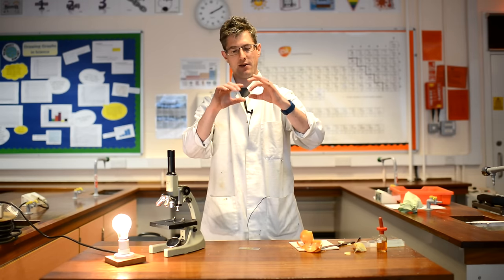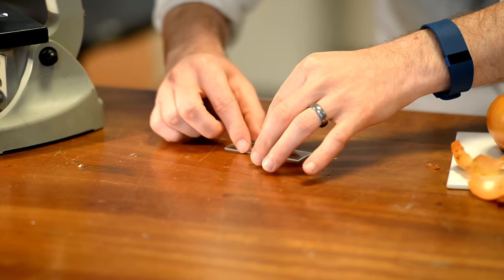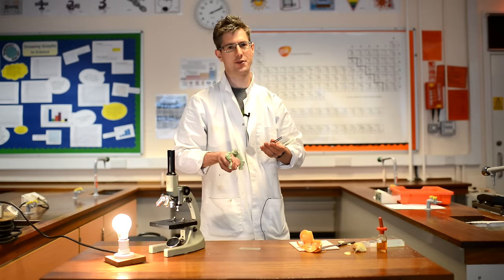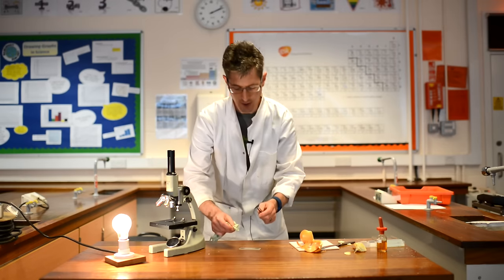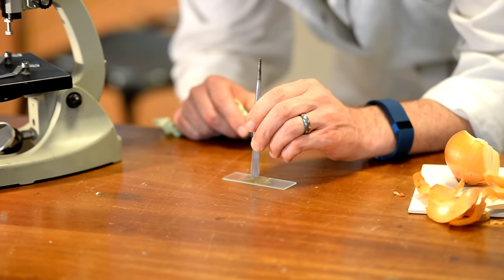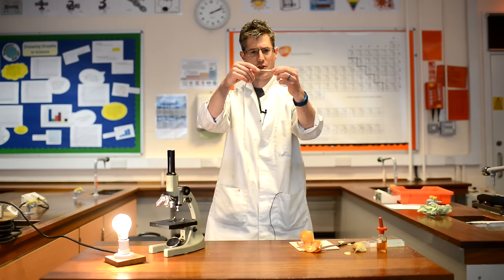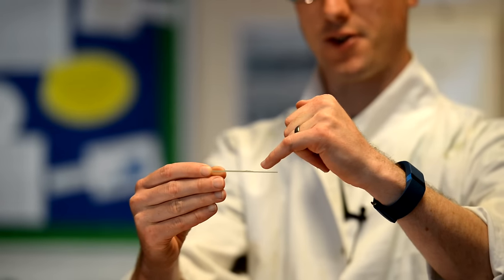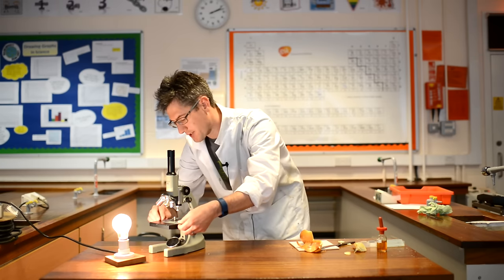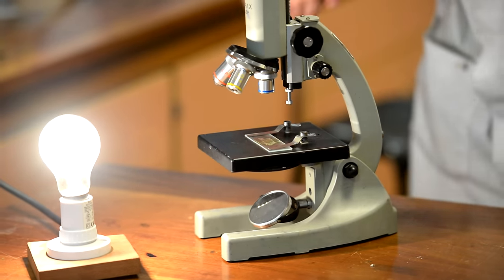Then you need to add a glass cover slip. Notice I'm holding it by the edges to avoid putting greasy fingerprints on the microscope slide, which would obscure vision of the specimen. Lower the cover slip on slowly, avoiding any air bubbles if at all possible. If at this point you've got excess iodine on the slide, just dab with a bit of paper towel to draw up the excess stain. You can tap down gently if the cover slip is not sitting flat. So you should then have: glass slide, onion skin, iodine, and then your cover slip. This goes onto the stage, placed under these clips which hold the specimen in place. The cover slip goes on the upper surface of the glass slide, otherwise the microscope will not focus properly.